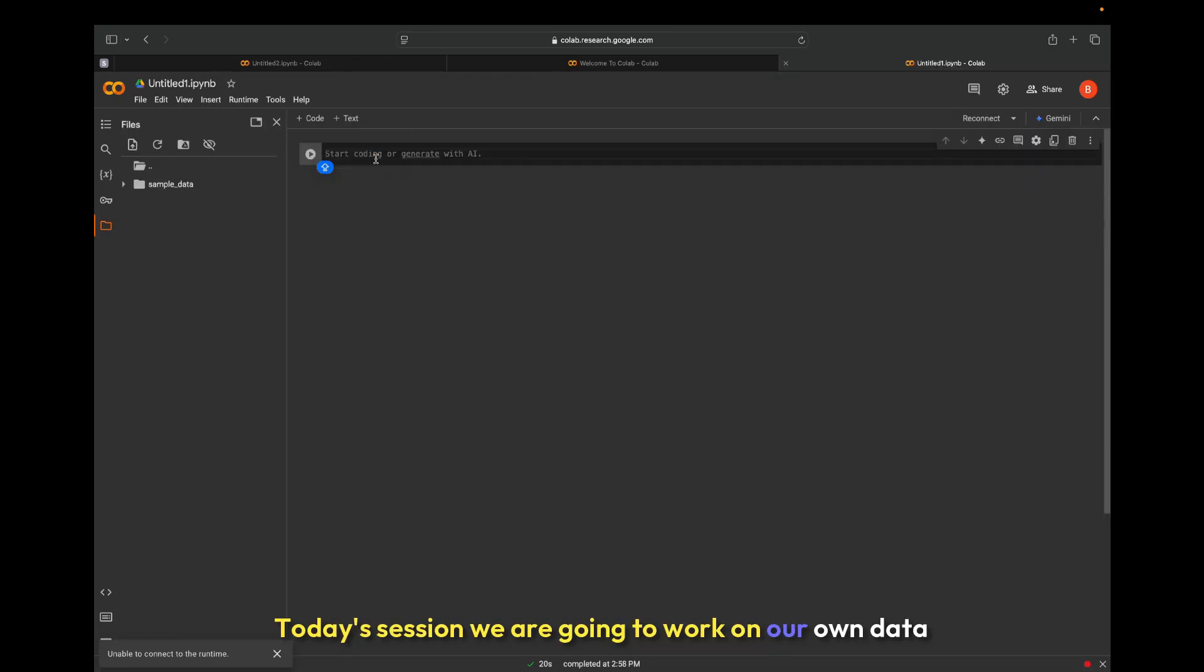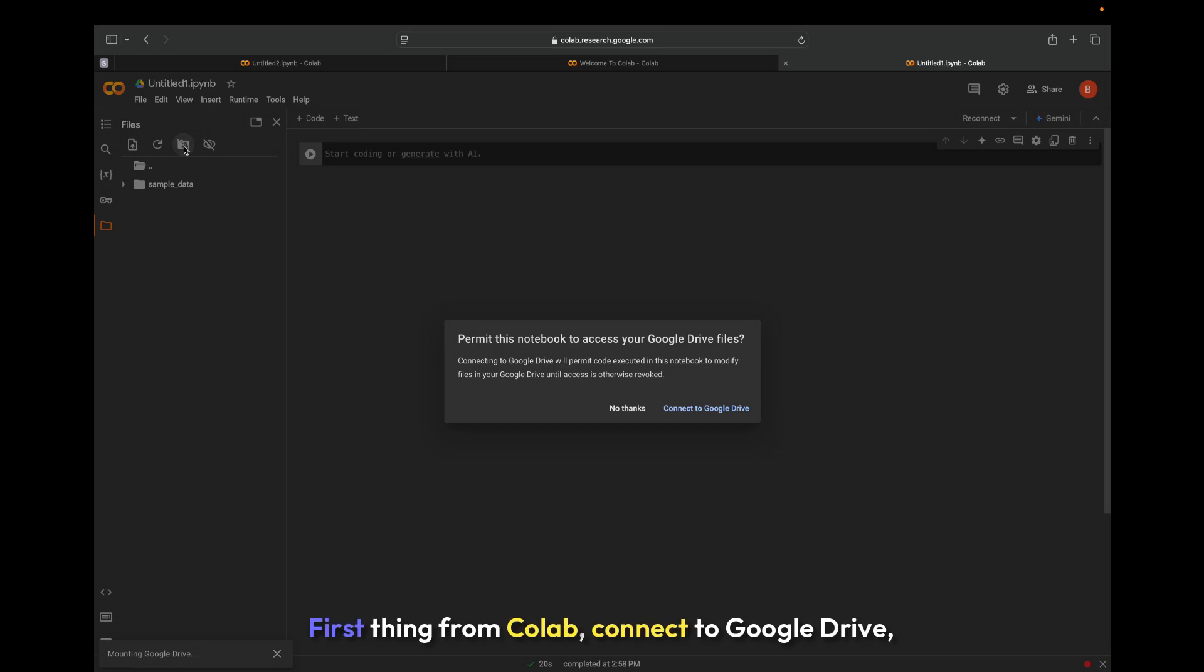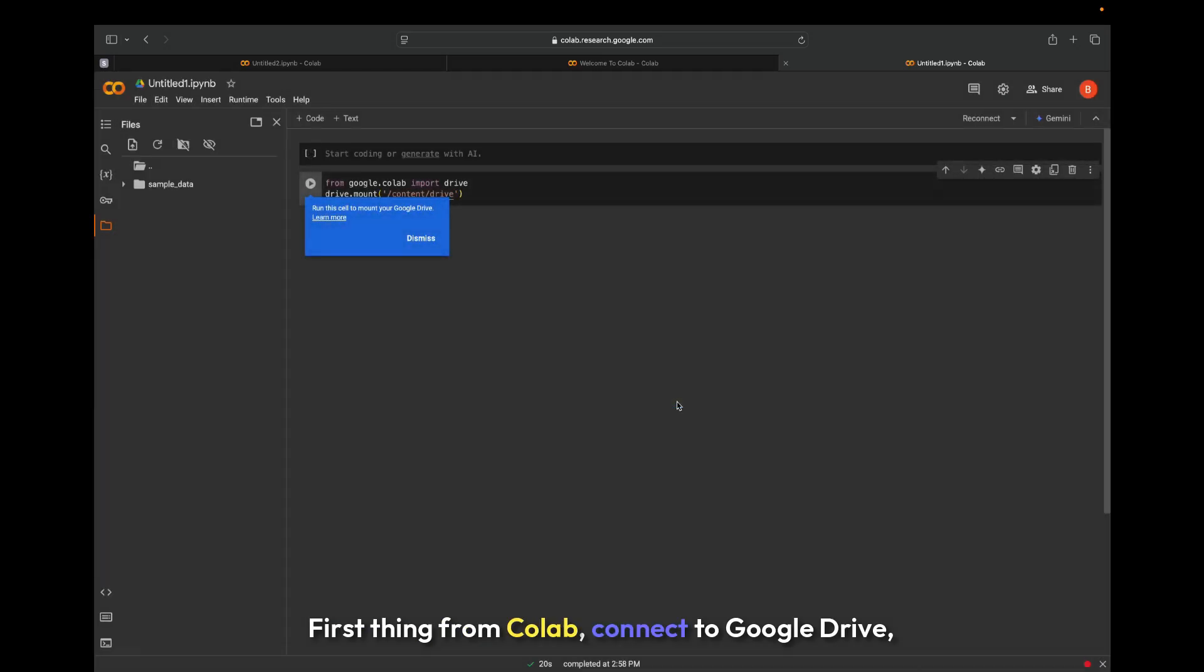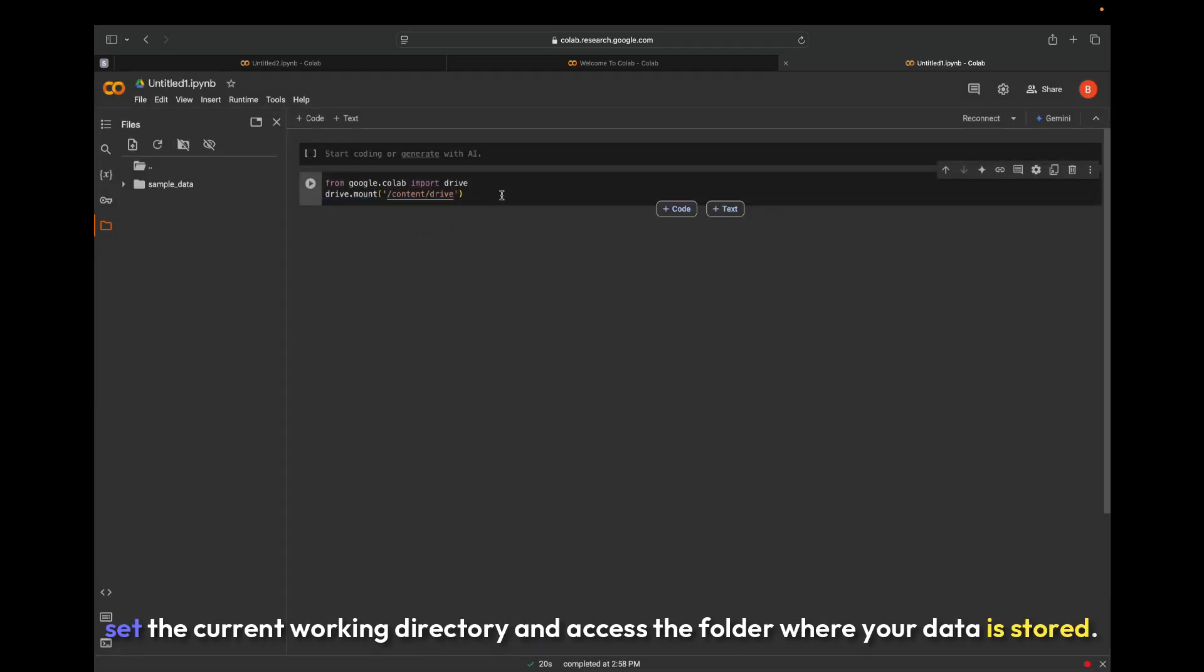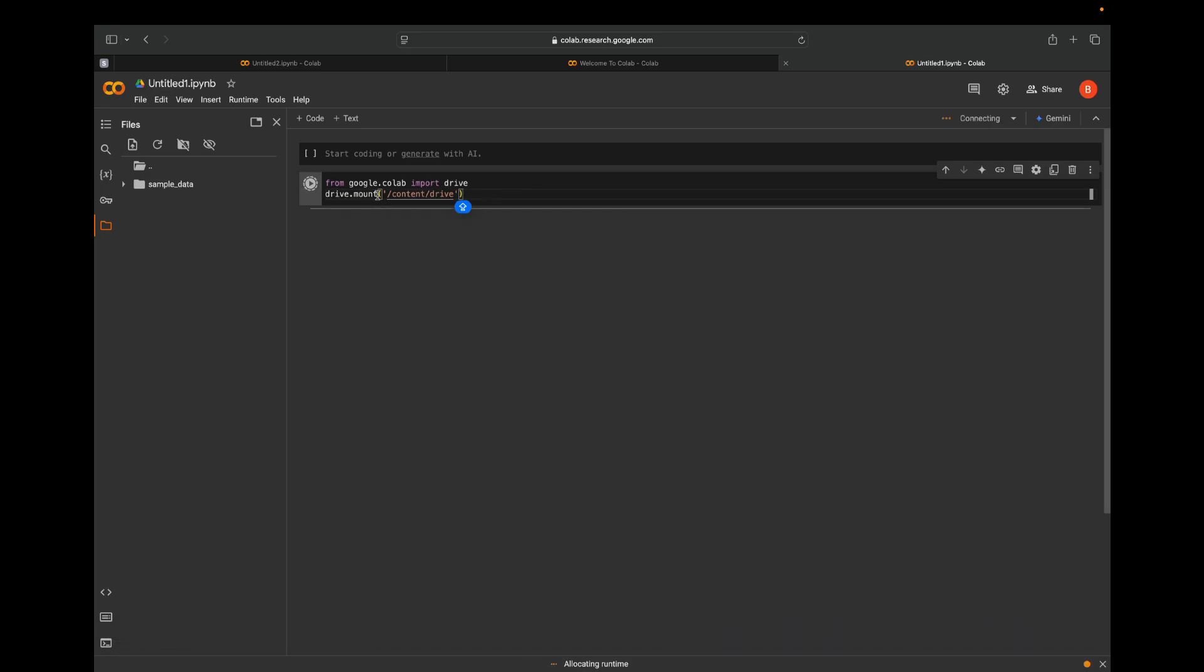Today's session, we are going to work on our own data and I will show you a few things. First thing: from Colab, connect to Google Drive, set the current working directory, and access the folder where your data is stored.